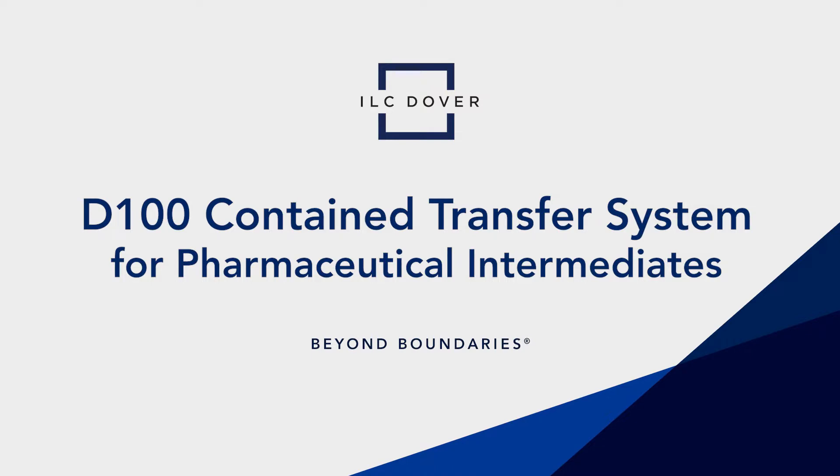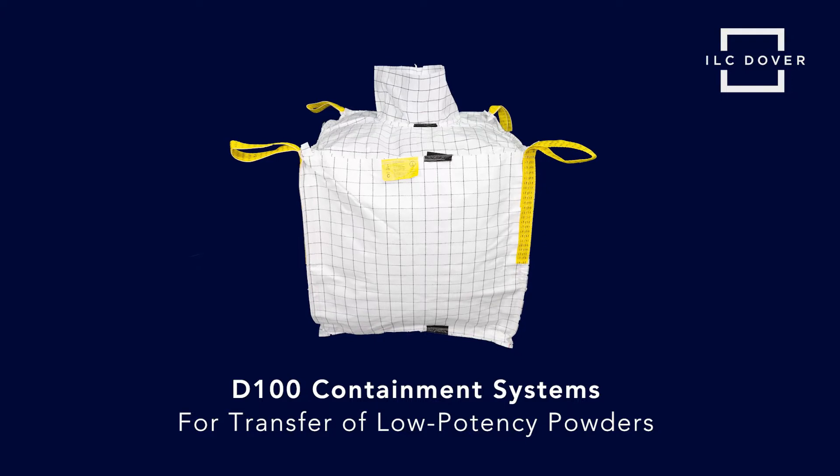In this video, we will demonstrate the step-by-step usage of our D100 containment systems for the transfer of low potency powders.